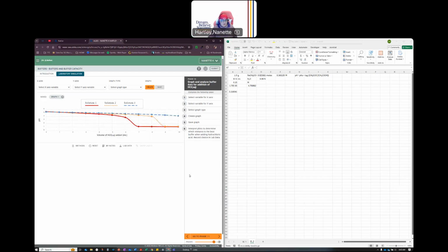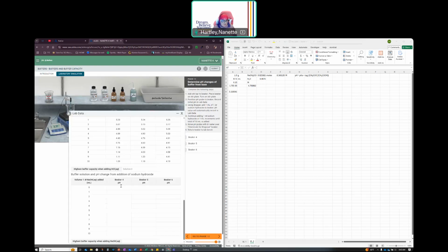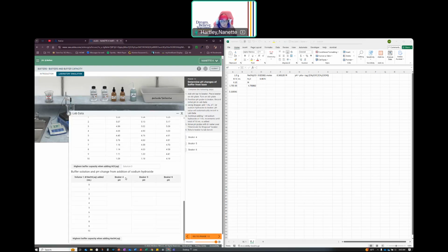Close this. Did save this, so now I can go to the next phase. And I would expect the same behavior. So here, the probe. Must have annoying sound. Then we put that in there. 5.34. And we're going to get the sodium hydroxide. Right.